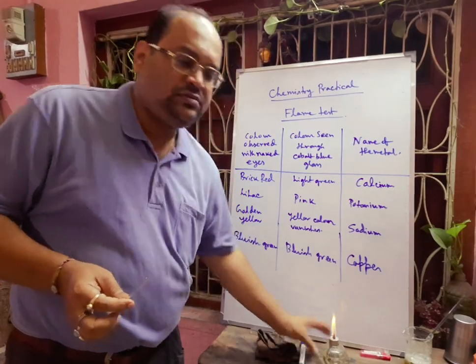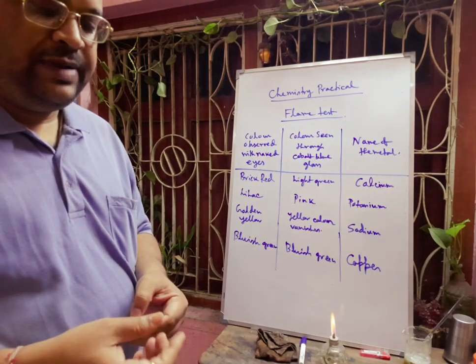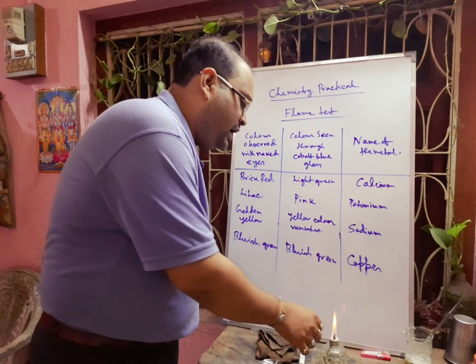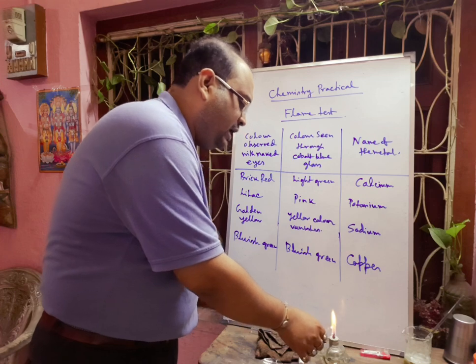Next, we will take another salt. First, you have to clean the platinum wire properly — again take some dilute acid and clean the platinum wire. There will be no color from the clean wire, and now it is not giving any color.